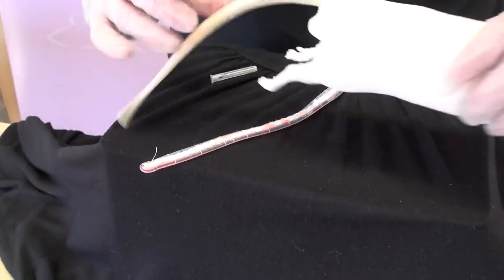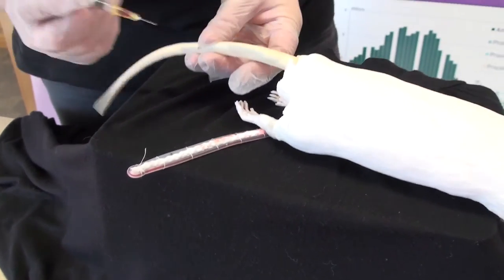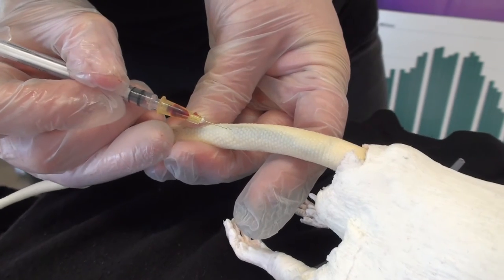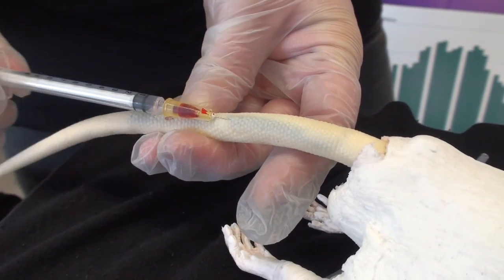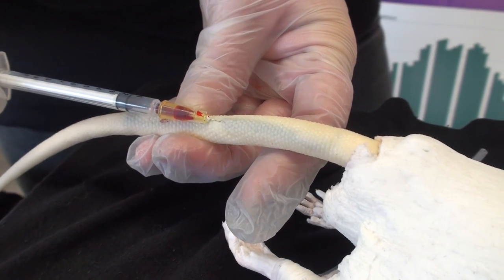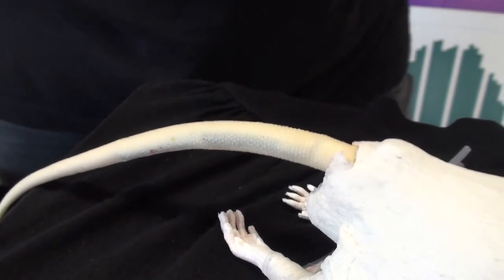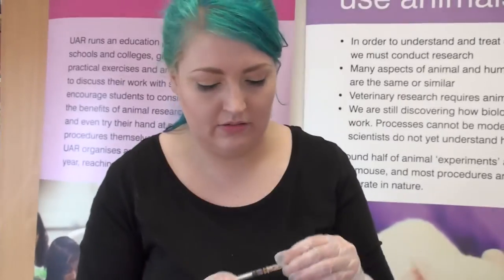On our larger model, again make sure the tip is going down, go into that blood vessel, pull back a little bit on the plunger, and then gently withdraw the needle. Cap the needle so it's nice and safe.